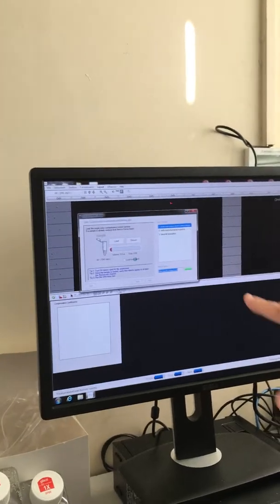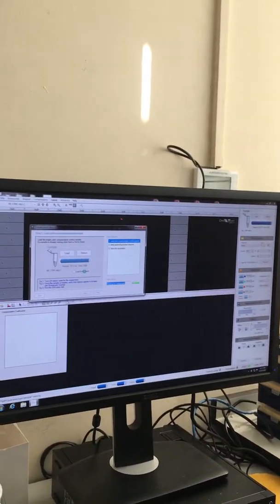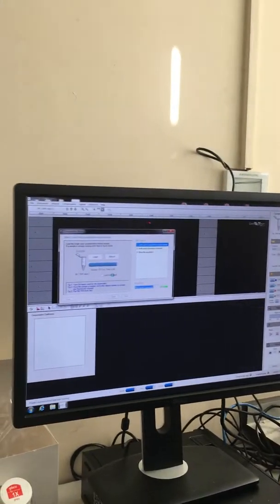So because it was showing 15 microliters, that was saying there is a minimum volume of 15. But you've got like 120, right? So now it knows it sucked it all up.